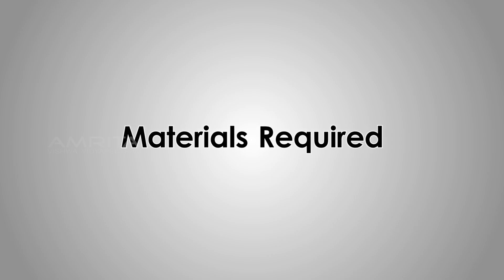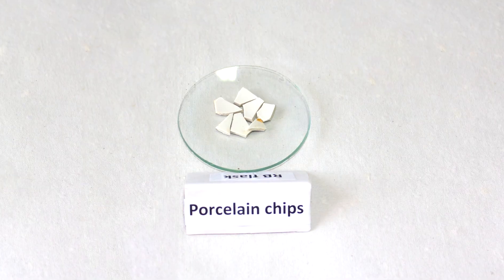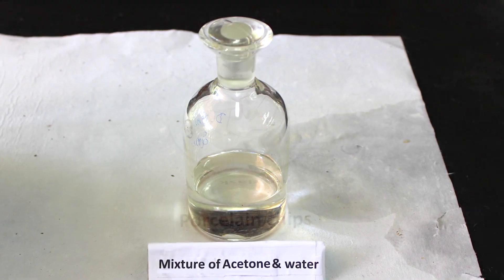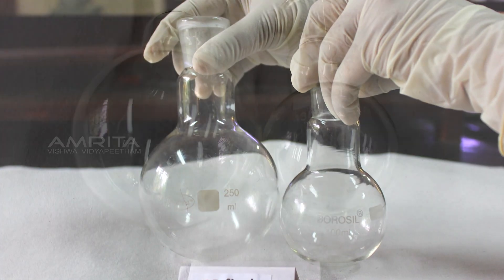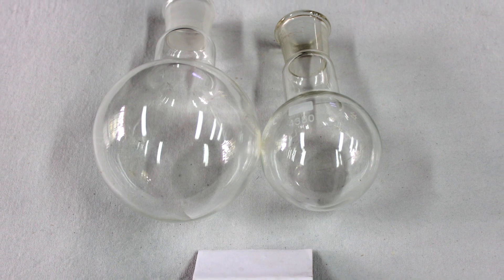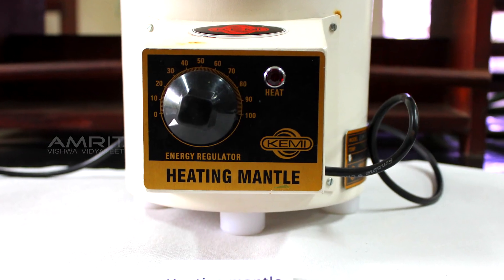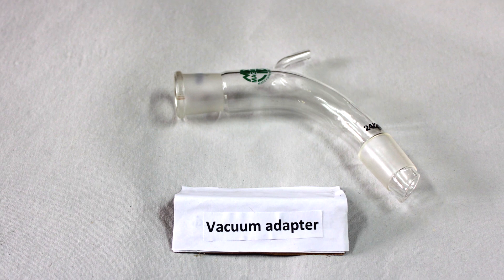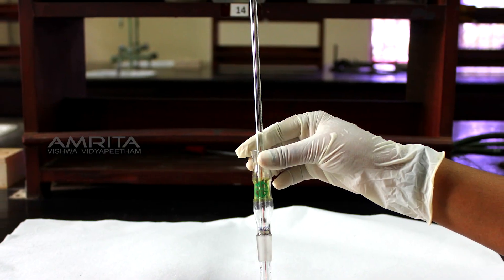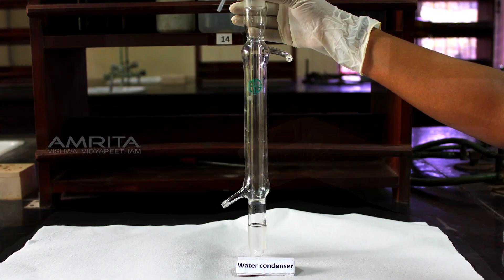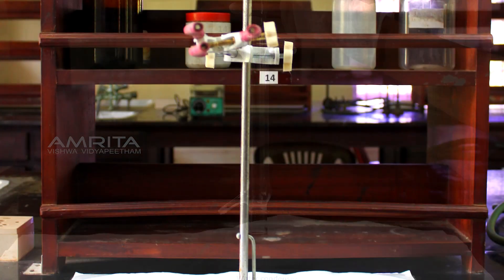Materials Required: Porcelain chips, mixture of acetone and water, 250ml and 100ml RB flasks, heating mantle, vacuum adapter, distilling head, thermometer adapter, water condenser, and stand with clamp.